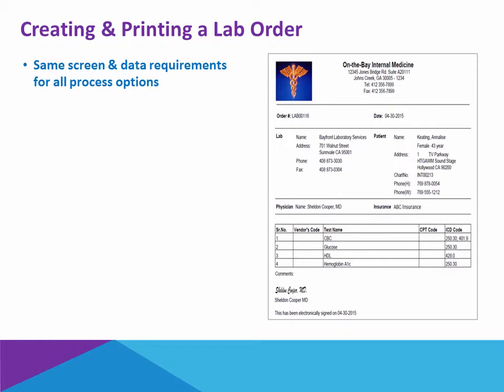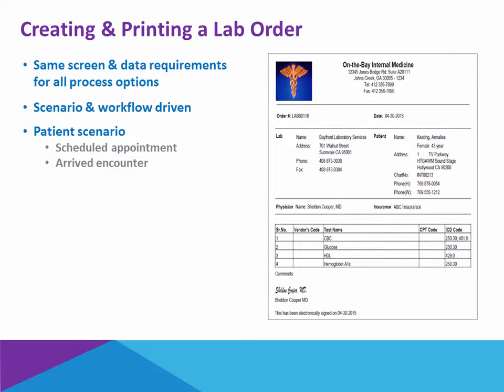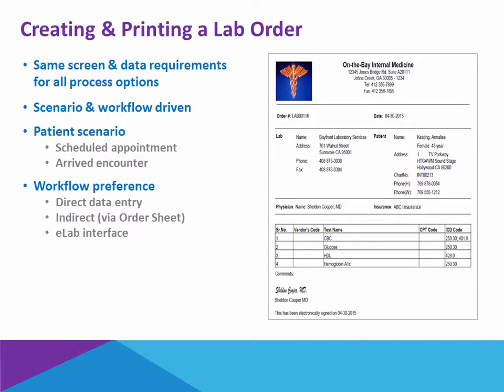To create a new lab order, the screen and the data requirements are going to be the same. However, the way you access the screen is what's going to vary. This will be determined by your local workflow as well as the specific scenario, such as whether or not the patient has an appointment, whether they have an encounter, and then whether or not you want to do direct data entry, whether you want to do it indirectly, whether you have an interface, and so on.